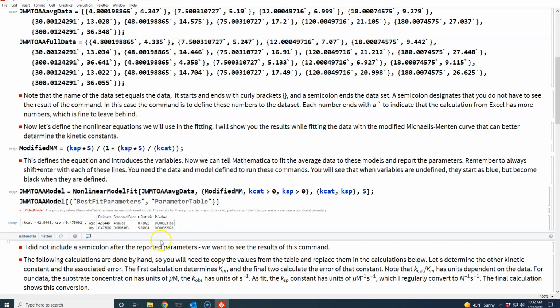So in order to save this, I wasn't actually sure if I right click and, so what's the best way to save that rather than, I mean, you can screenshot it, but what's the best way? So on the very right there's a little bracket that's around the output. Yes. So if you right click on the bracket on the very right hand side, okay, bracket on the right hand side, like right all the way to the edge of the screen.